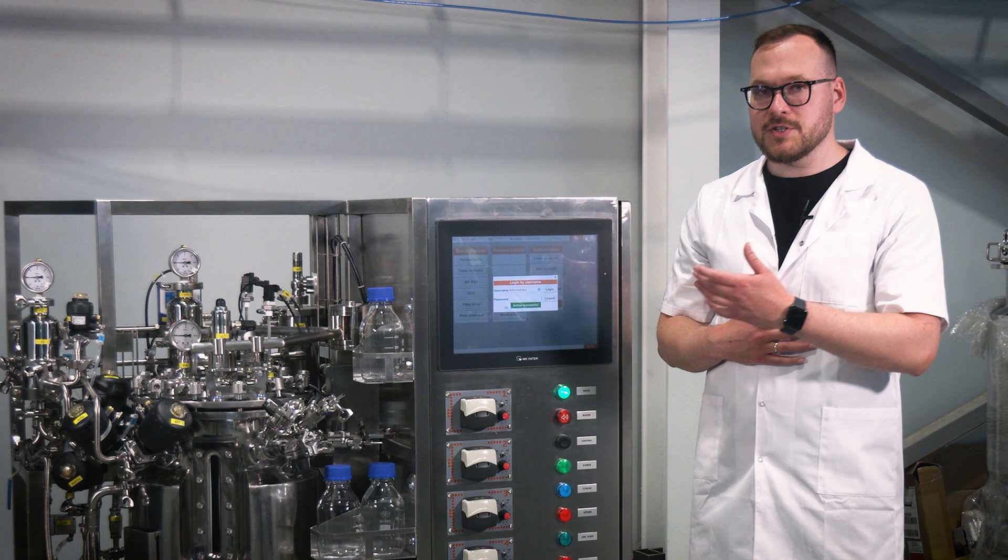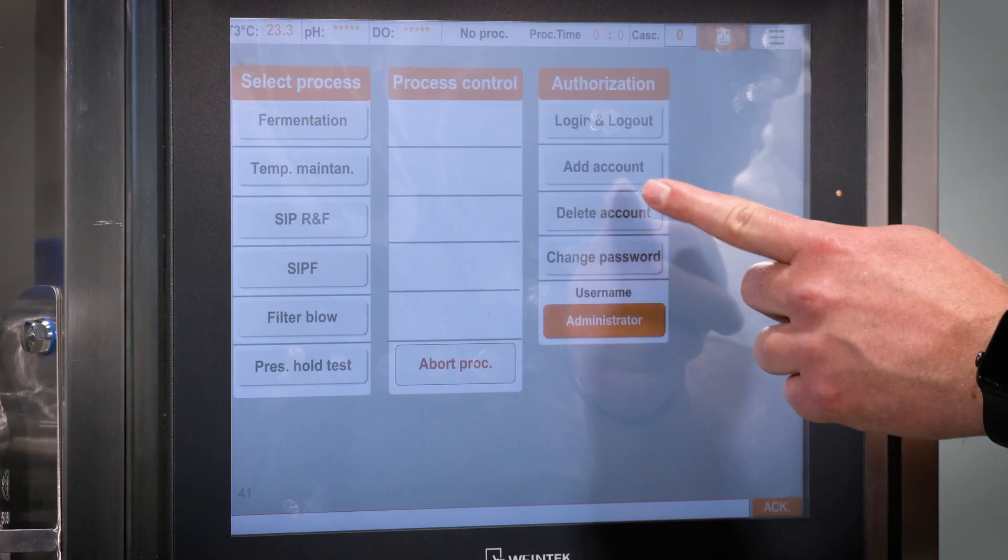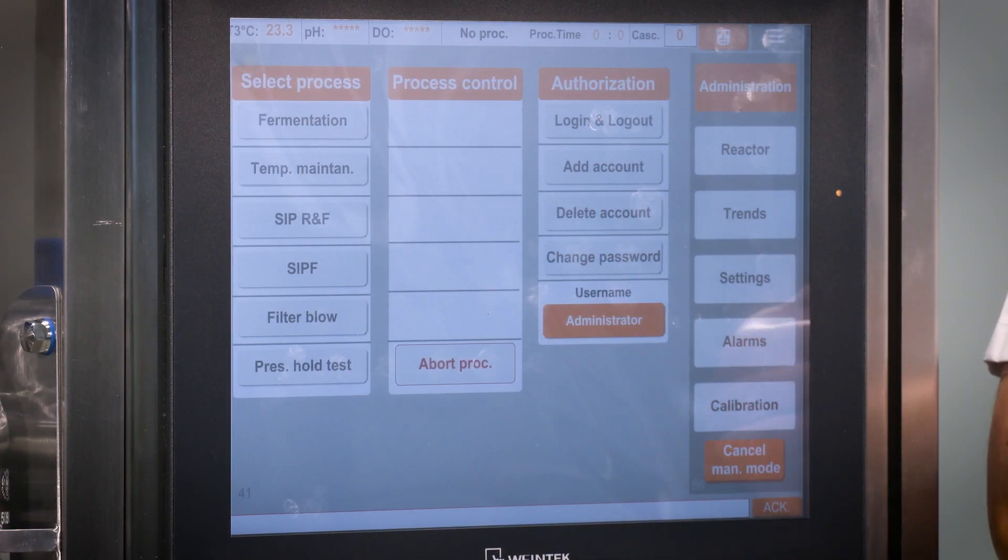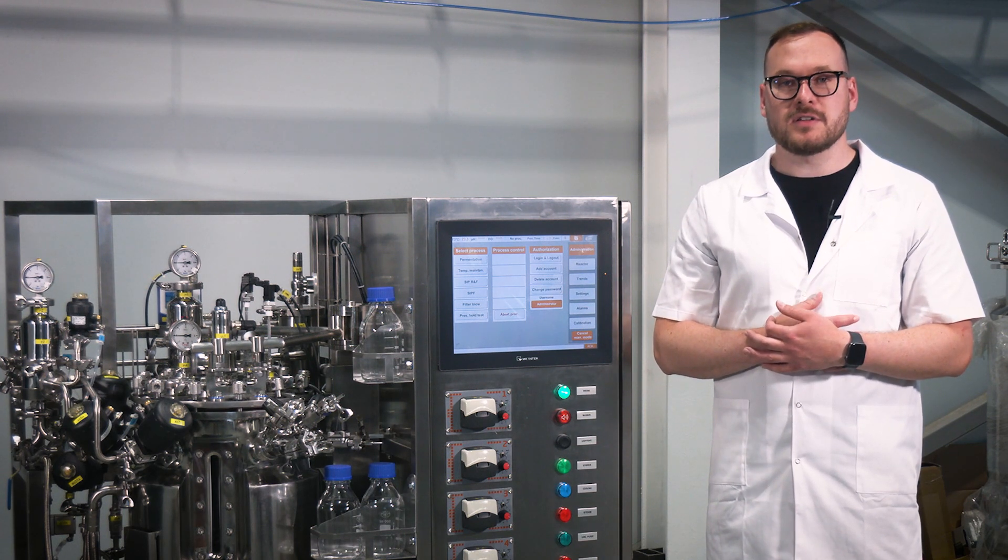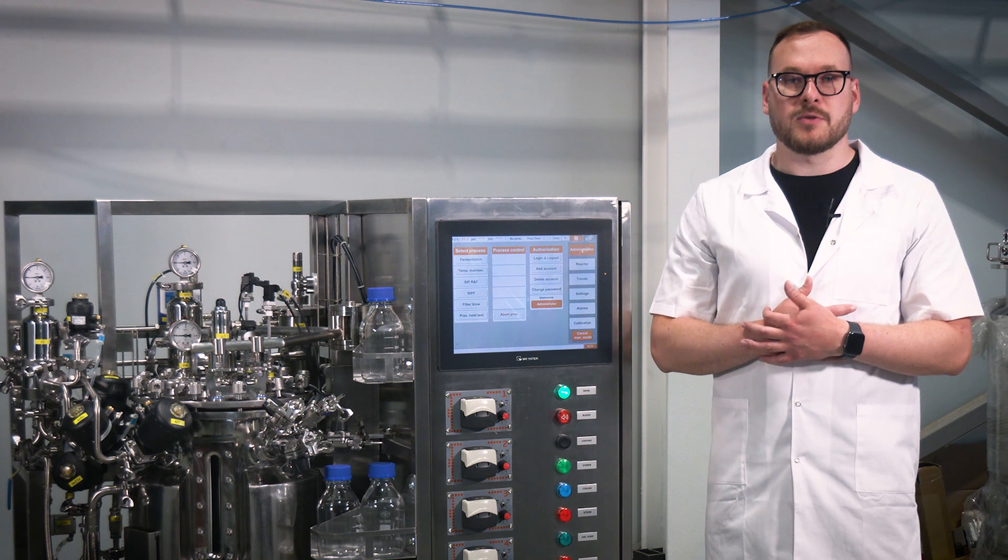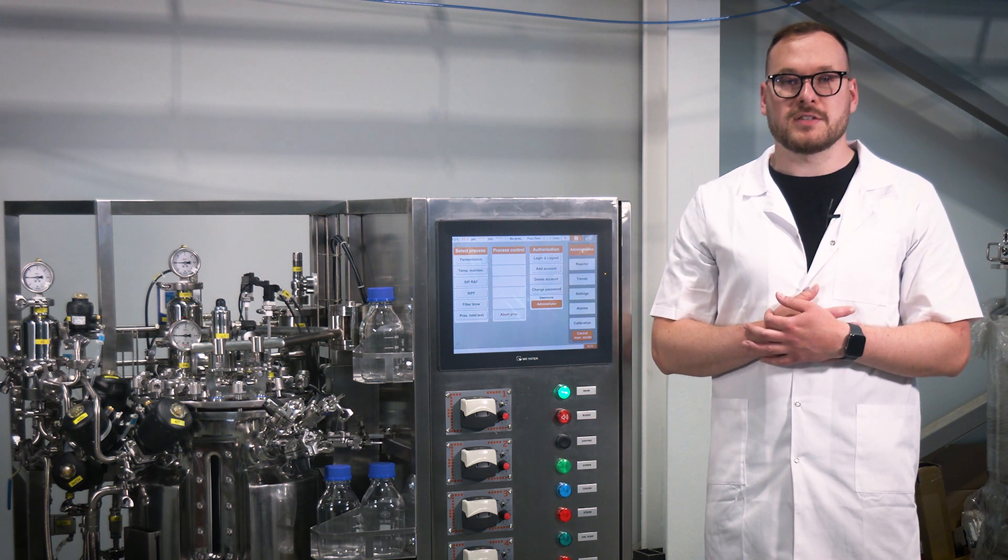View the administration, reactor and alarm windows. Operate all control elements: valves, pumps, motors, etc. and enable manual mode within the bioreactor window.